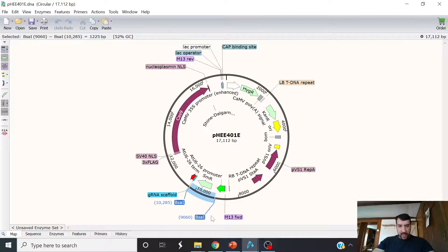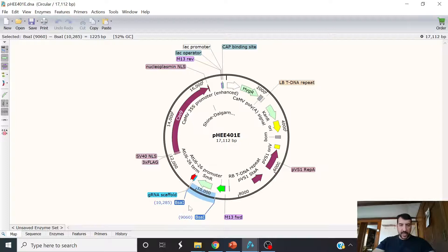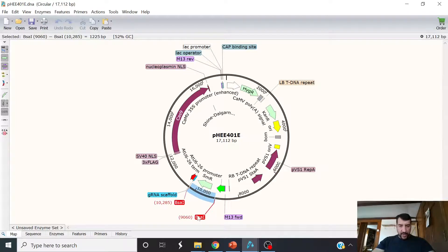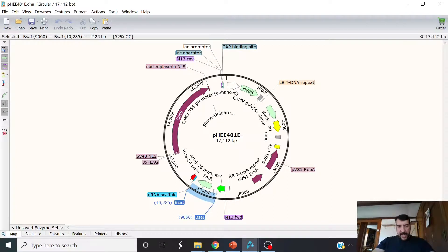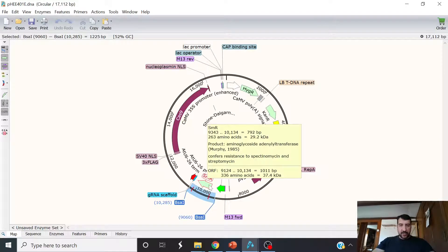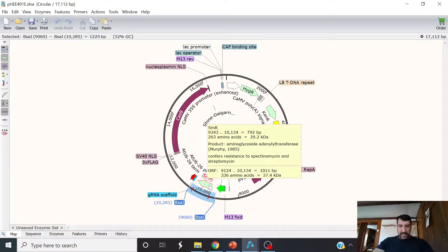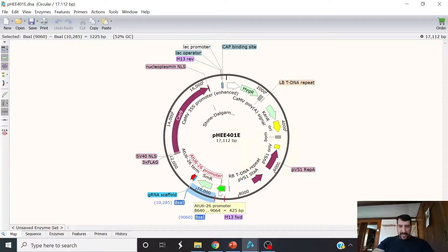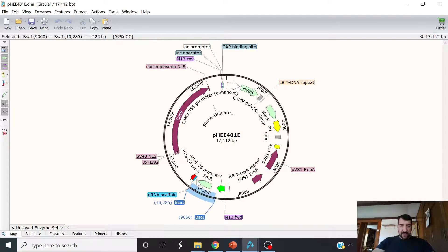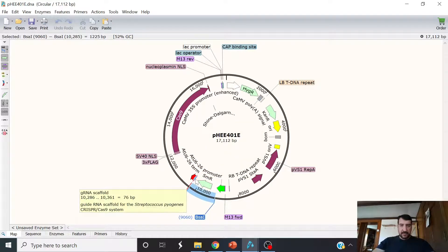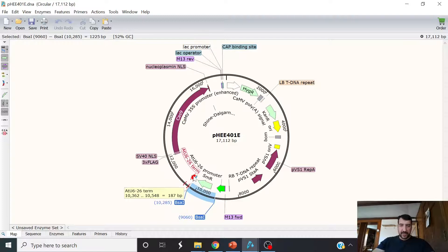Now, this one is a little bit different. So this one uses BSA1 instead of BBS1. And in this case, the sites are not real close to one another, as you can see here. They're 1,225 base pairs apart. And you'll actually cut out a spectinomycin resistance gene in the process of doing that. But that'll move this ATU6-26 promoter right in front of the protospacer and gRNA scaffold. And then there's the terminator.